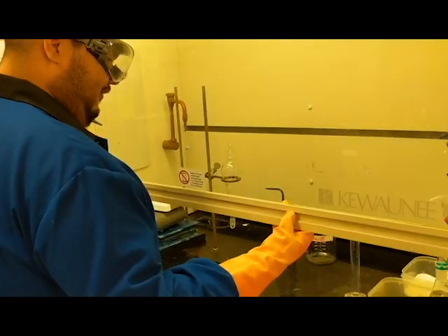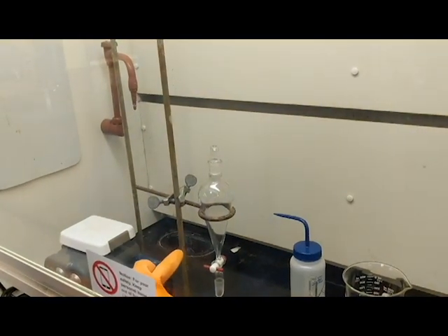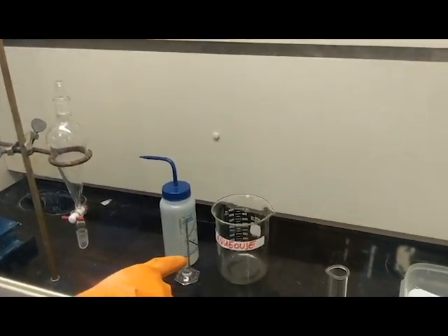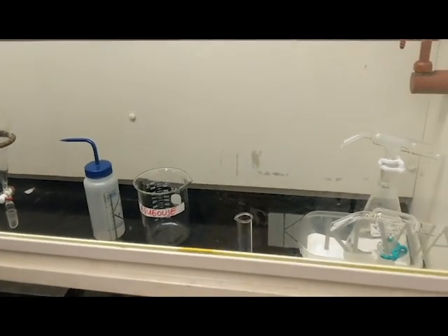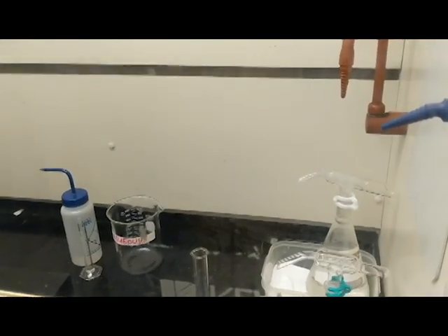I'm going to lower that for a minute so that you can see inside of the hood. I have my 125 mL separatory funnel, my 10 mL graduated cylinder for water with a bottle of DI water next to it, and my 1 liter beaker labeled aqueous waste for my wash. So we're going to start by me demonstrating how to use the glass repipetter.